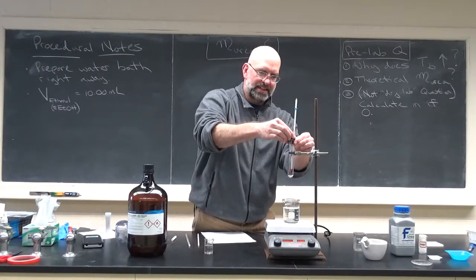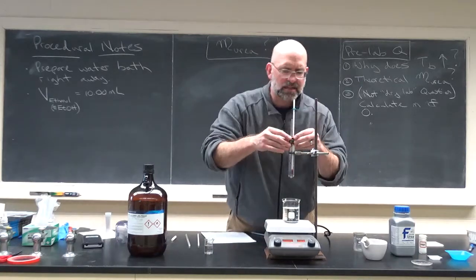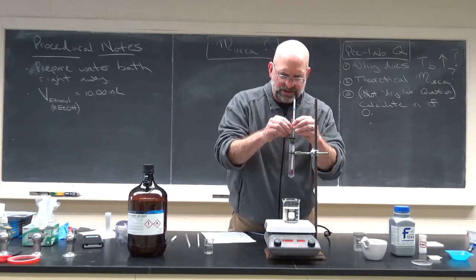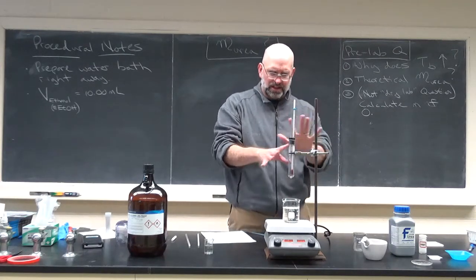And that should sit in there pretty snugly. There shouldn't be any cracks. Check the stopper, make sure it's good. Its integrity is good, and then it sits in the test tube rather snugly. That should be fine.